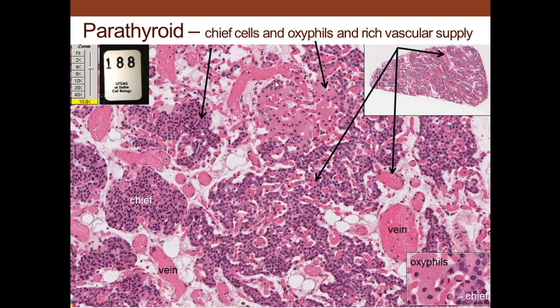They're just there. Here again we see oxyphils, a lot of space between nuclei because the cells are very big compared to the chief cells, as we see here. Also, the chief cells are more bluish than the more reddish color of the oxyphils.